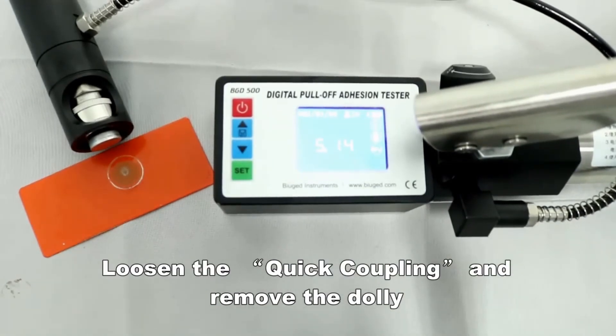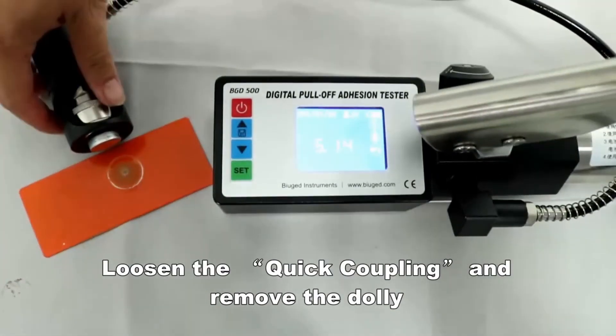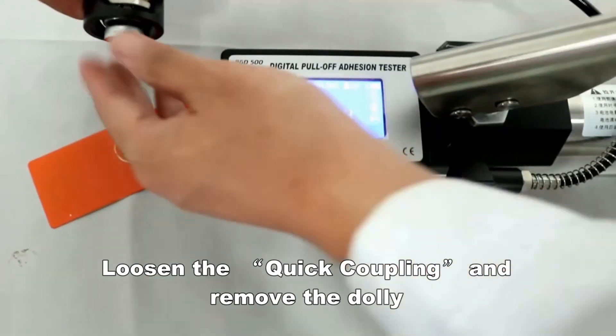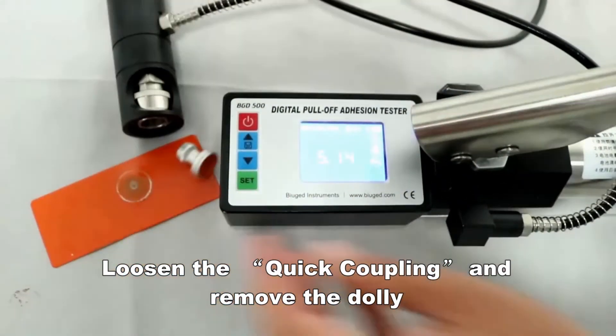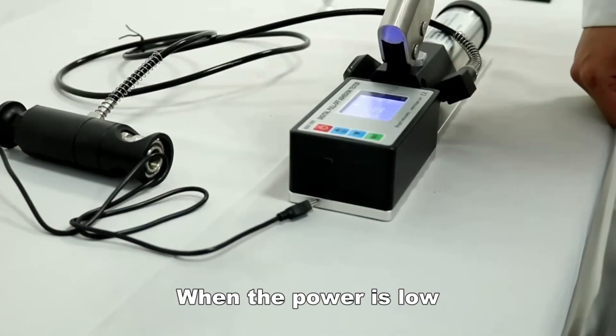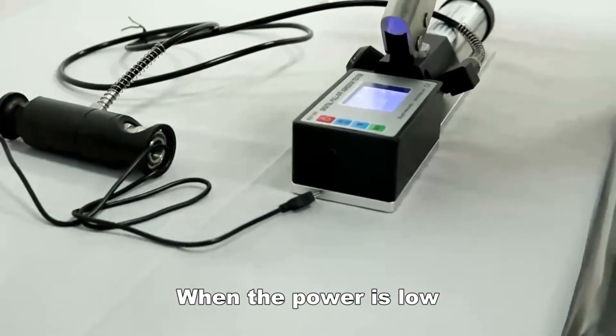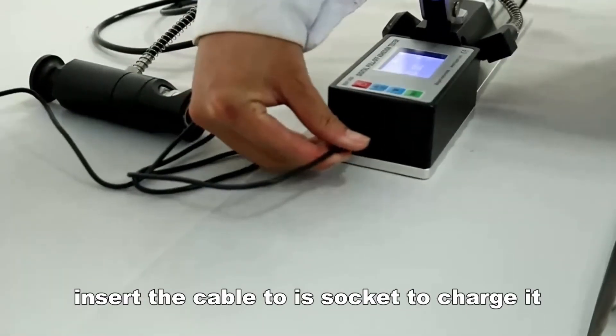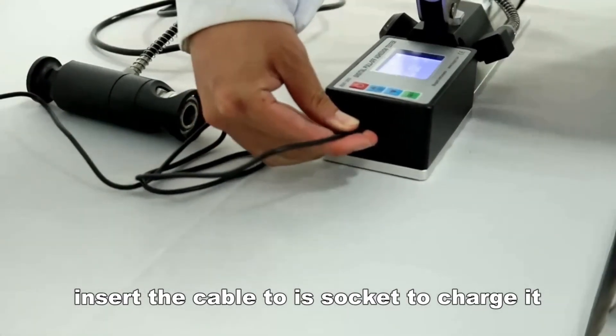Loosen the quick coupling and remove the dolly. Press the power button again to zero the tester. When the power is low, insert the cable to a socket to charge it.